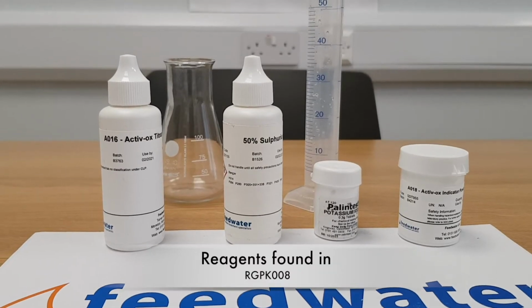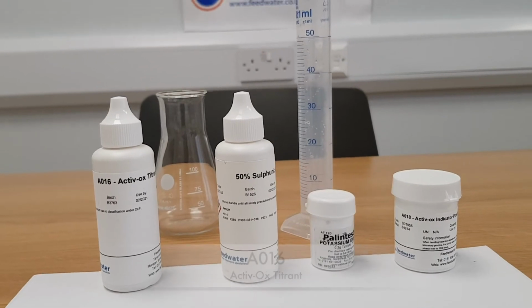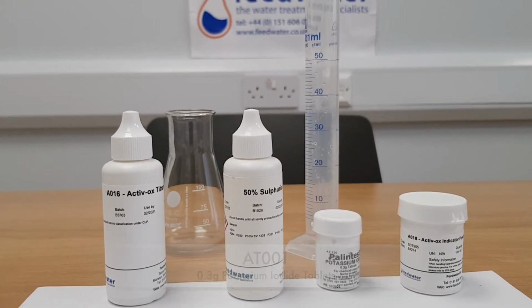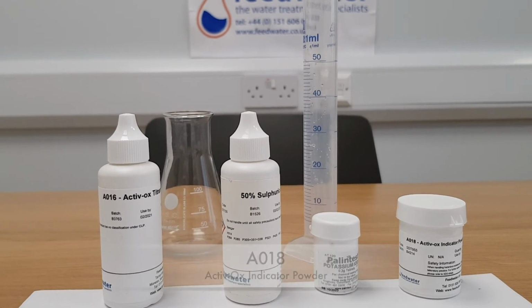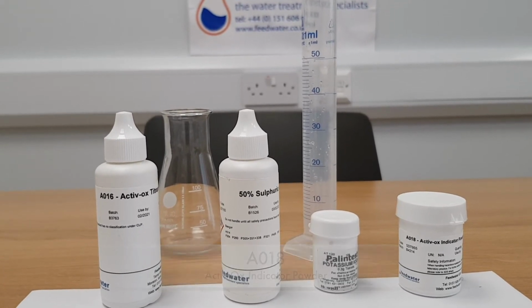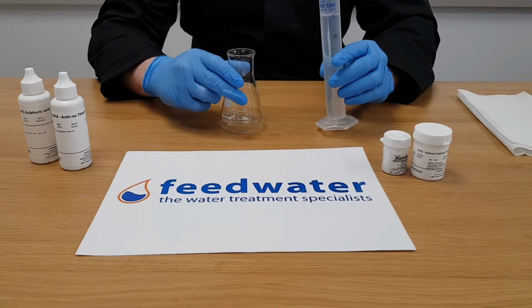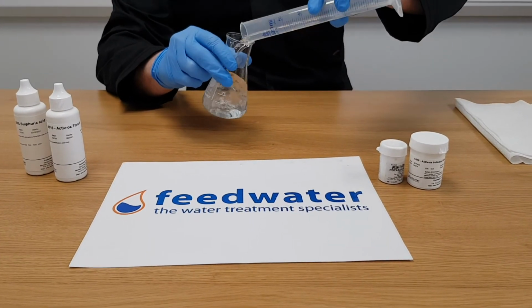For this test, you will need the following reagents: Activ-Ox titrant, 0.3 gram potassium iodide tablets, 50% sulfuric acid, and Activ-Ox indicator powder. For most applications, we expect the range to be 0.25 to 1 mg per litre of total oxidant, so we would recommend using a 50 ml sample volume. If you're expecting higher or lower results than this, you may wish to opt for an alternative sample volume as shown. In this example, we'll be using a 50 ml sample volume.